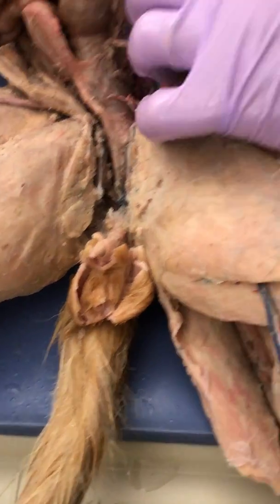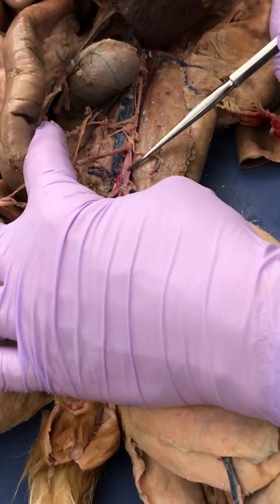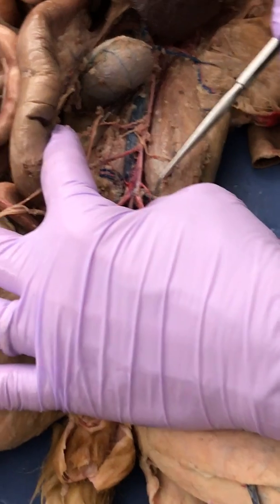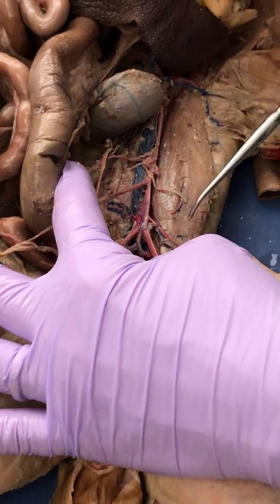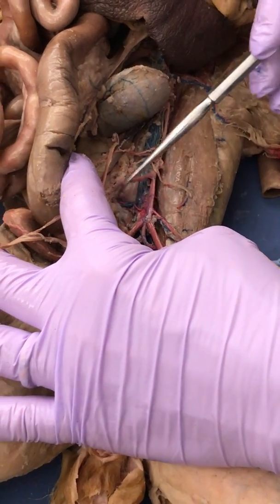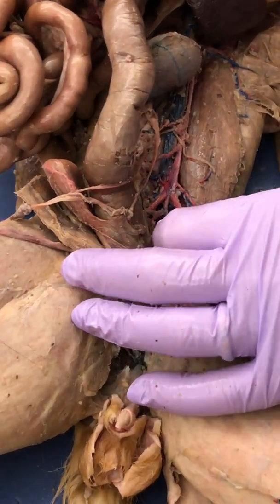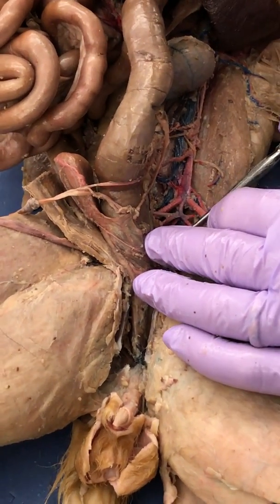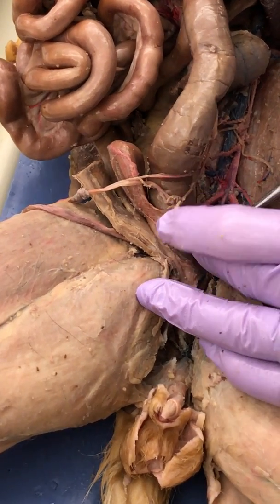So back here. Everybody told me that was inferior vena cava. What's that? Abdominal aorta. And then what's this one? Iliac. Here it is on the other side. See it? Okay, how about this one? External iliac, good. Internal iliac. Just dissect it out really well, ladies.